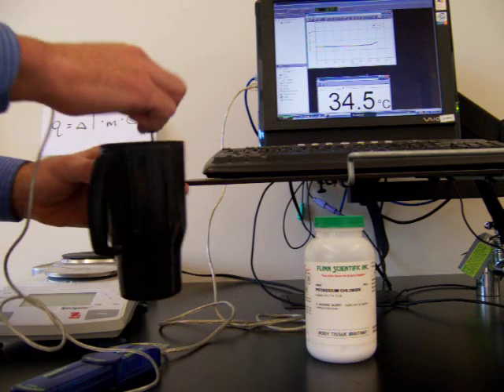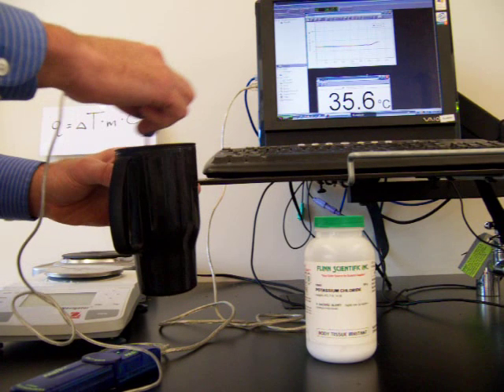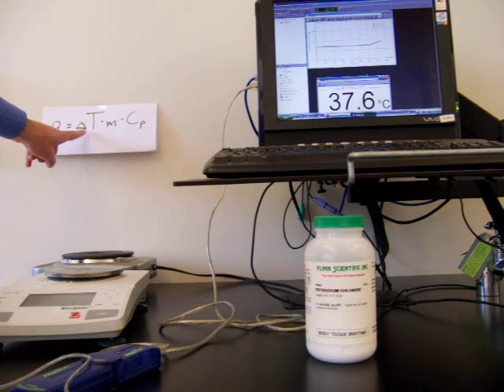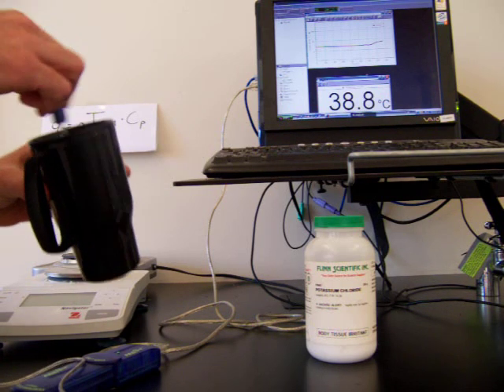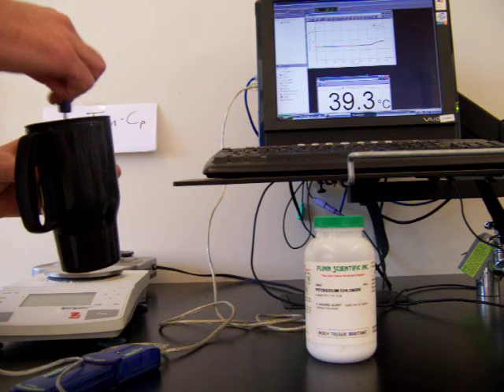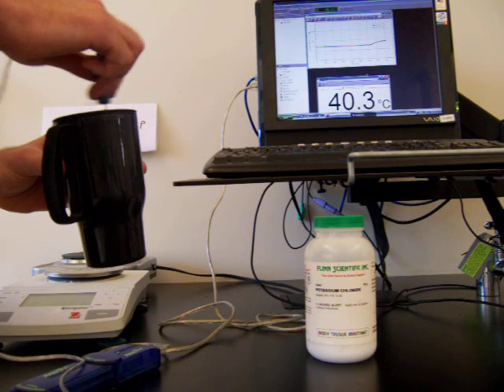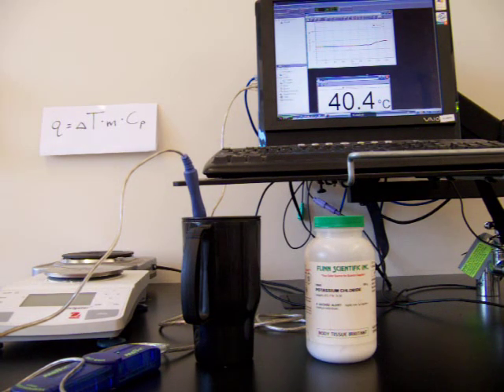The sodium hydroxide continues to dissolve as I stir to help it dissolve more quickly. The temperature continues to go up because heat is being released as the sodium hydroxide dissolves. It looks like we've reached a maximum temperature and the solid is almost completely dissolved. It's completely dissolved and we have a final temperature of 40.4 degrees Celsius.